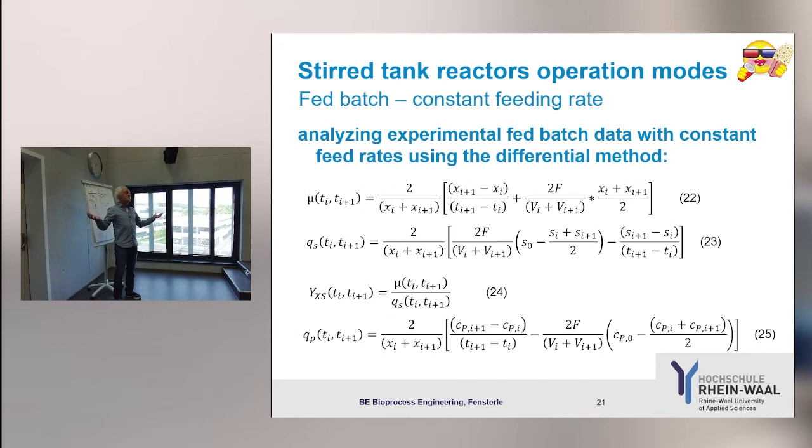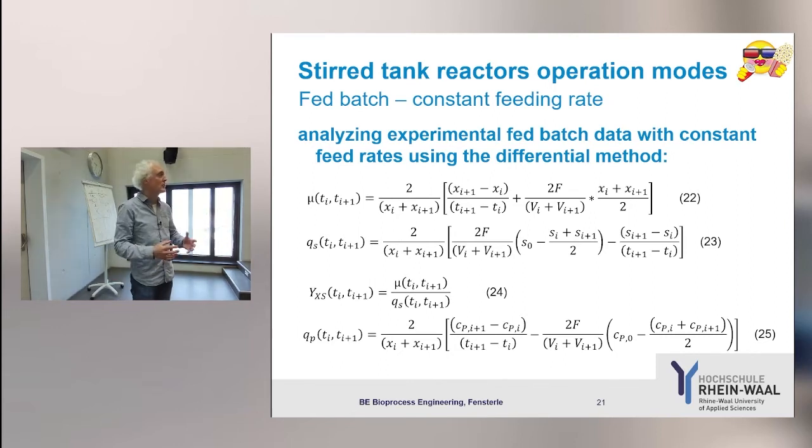But it's about measurement precision. Do you remember how your CFU values looked in the methods section? I think you did this also in presence, the methods in applied microbiology. And your CFU values had error bars of a couple of 100%. All the measurements here are in general so imprecise that you don't gain tons of precision if you take a lot of samples. If you just look at one value, this is useless. You will average over a couple of values.